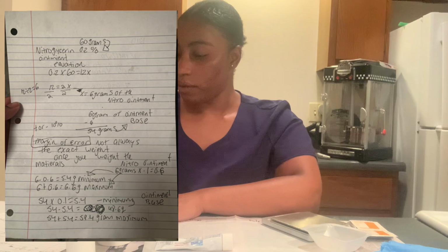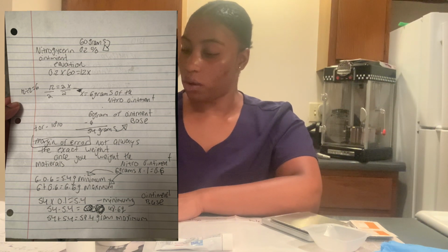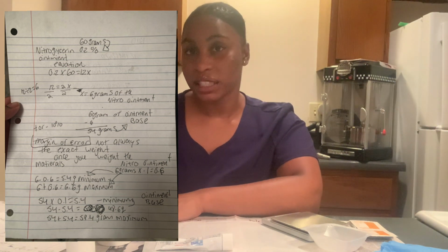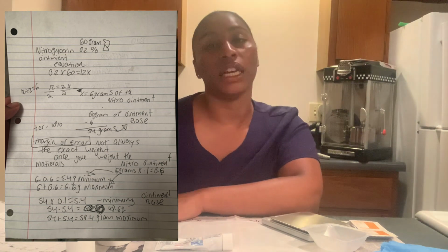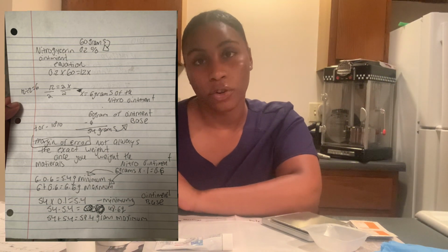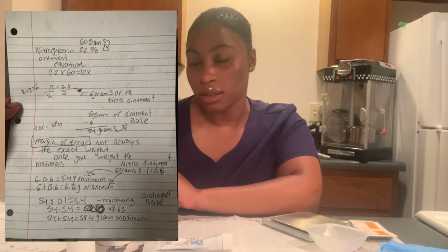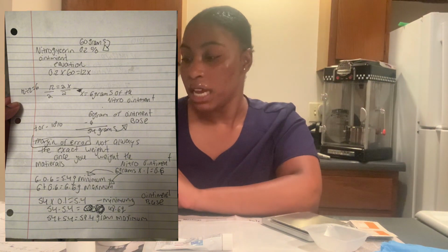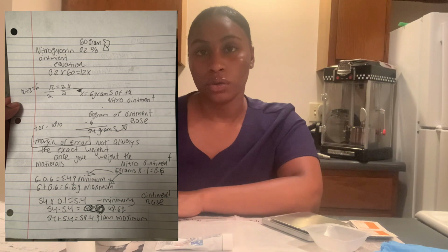So that 5.4 grams that I just explained for the minimum weight is for the nitro ointment. The nitro ointment is, remember, 6 grams, so our minimum weight of that would be 5.4 grams. The maximum weight would be 6 plus 0.6, which equals 6.6 grams. So that's the maximum amount of the nitro ointment that we are allowed to use once we begin making our prescription.